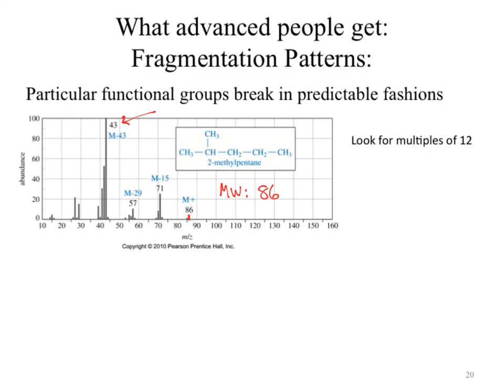There's another reason that I was aiming for the bromine, but good job on the math. You would need to look for an M plus 2 peak. We would need to see a peak of equal intensity at 88. Is there anything there? Nope. No bromine. What does that also mean? No bromine, no chlorine. And no iodine. For what reason? It's too small. Okay. At this point, I personally would move on, on a complete solve. When it comes to multiple choice, I would use that information and see what I could find.